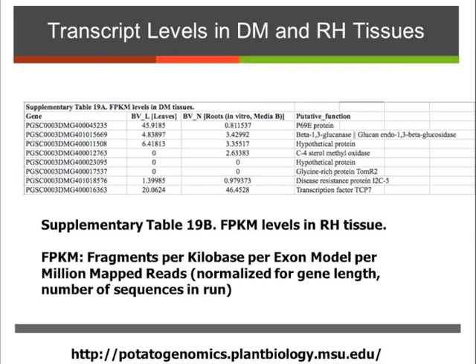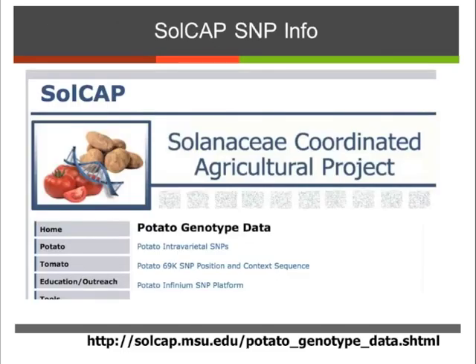The units for this RNA-seq data are normalized for the length of the transcript and also for the number of reads you've got per lane. So it's in what's called FPKM — fragments per kilobase per exon model per million mapped reads. Just think of this as a normalized value that you can use to compare down a library across many genes and also between libraries.